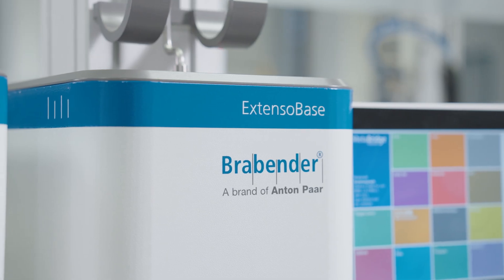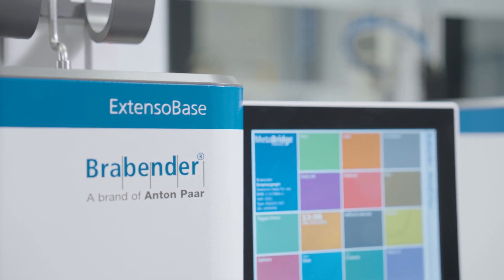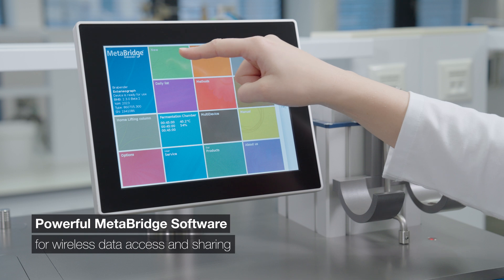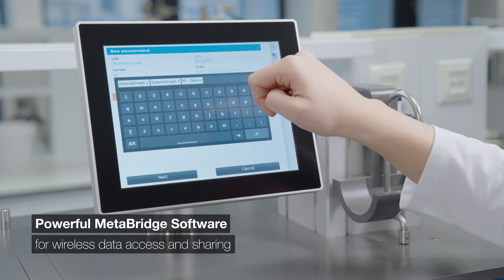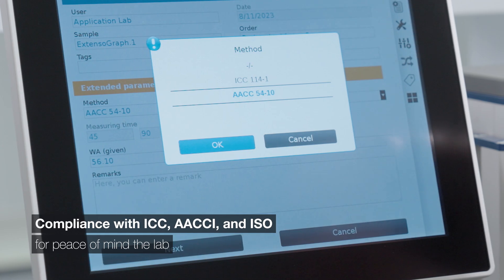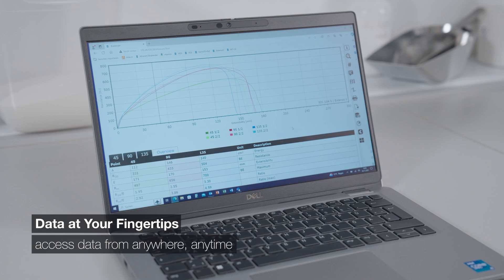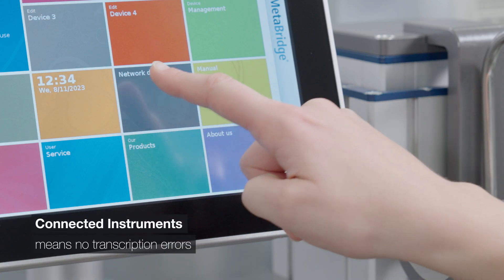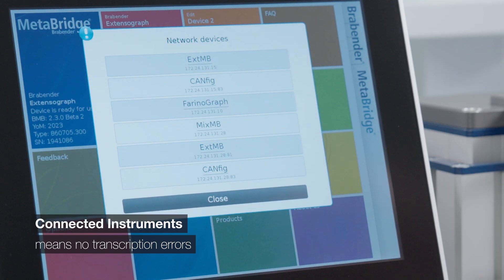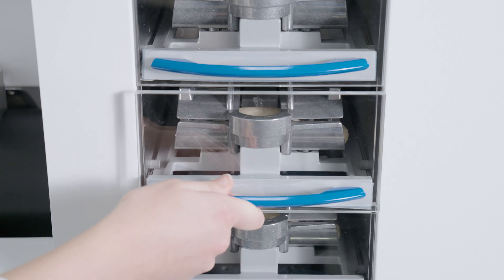From fermentation cabinets to stretching hooks, customize the Extensograph experience that's right for you. With the state-of-the-art MetaBridge operating software, access and sharing have never been more seamless. Use your preferred measuring standard with a simple click. Access your data from anywhere, at any time. Connect multiple instruments and share insights with colleagues — whether through ERP, LIMS, or direct email — to reduce throughput times and errors.